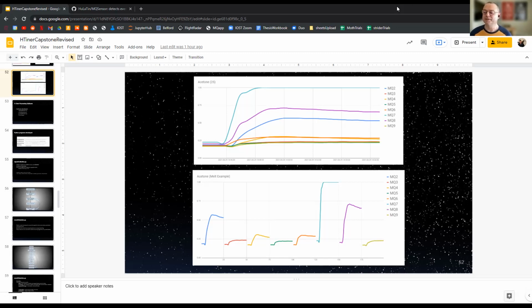It sounded a little like there was an intuitive, gut-feeling process. It probably wasn't like that. But my question is, is there a more formal way to do things like that? To basically do this kind of signal analysis? You're talking about in regards to eNoses and the signal analysis of these MOS sensors? There are a few more industrial uses of eNoses. In general, in a more mathematics-based way, how could you do this more formally, to figure out what's important here and what is not?